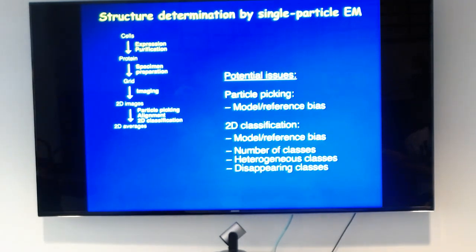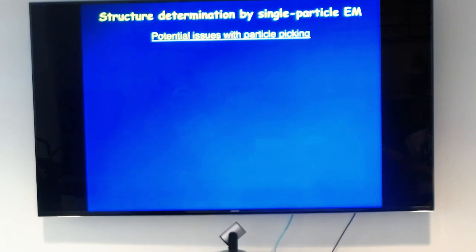But you can actually gain a lot of information from 2D classification, just not with RELION. Can you go more into depth about why RELION is not good for 2D? Can I go 2 or 3 slides further? Sure, yeah, yeah. We'll do that.